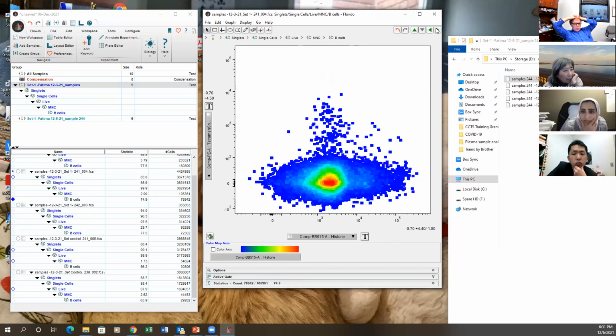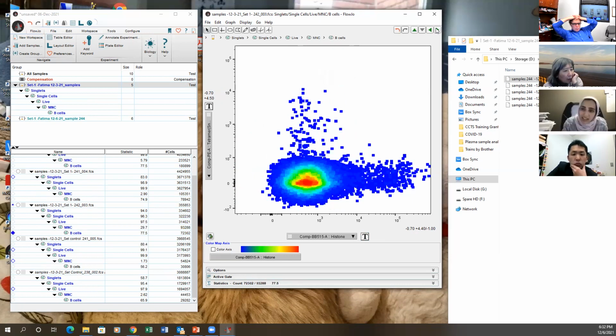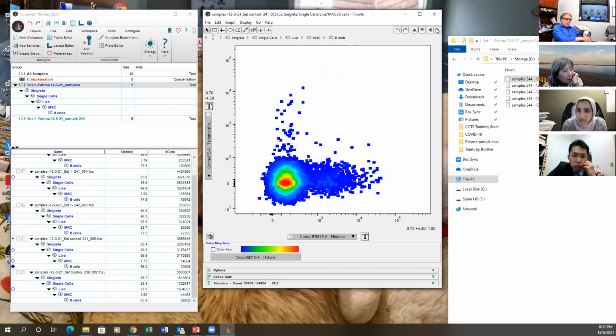Yeah, so probably this is non-specific. Right. The control was positive. Like this is right. And this is after you cut down. Yes, to 1 to 100. Right.